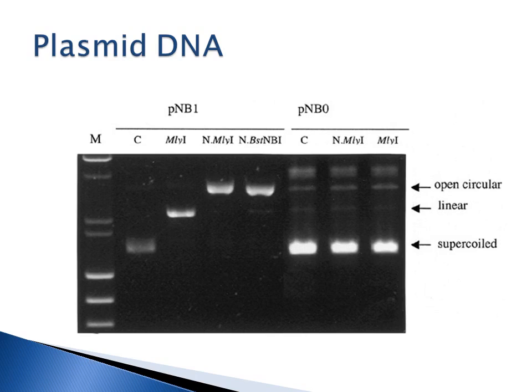In the next lane, you have plasmid that's cut with different enzymes. So it's going to cut at various locations. We're going to talk about restriction enzymes later. What's important to know here is if you cut your plasmid DNA, it's going to run higher than your supercoiled DNA. So it's going to run similarly to a linearized or a relaxed plasmid because it's been cut with an enzyme.